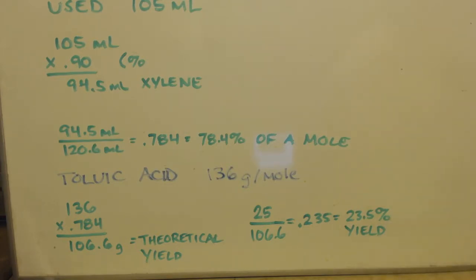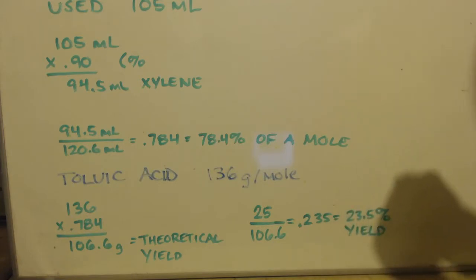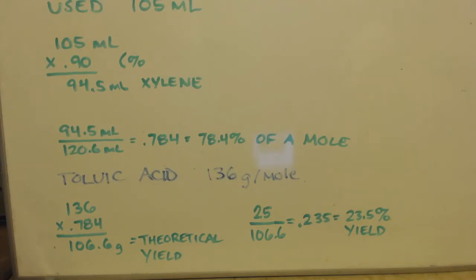One of the things I wanted to do is talk about the experiment. You notice in video 1, where I'm actually refluxing, I noticed that there's a lot of green going on there. What that green might be is N2O3, which is basically a combination of the NO gases and the NO2. Get it? NO, NO2. Get a molecule of each, you got N2O3. It's green, although it usually doesn't happen except at cold temperatures. But you know, chemistry, there's always a little bit of something going on the side that shouldn't be happening, but does. So it might be that, I don't know, I'm just guessing.